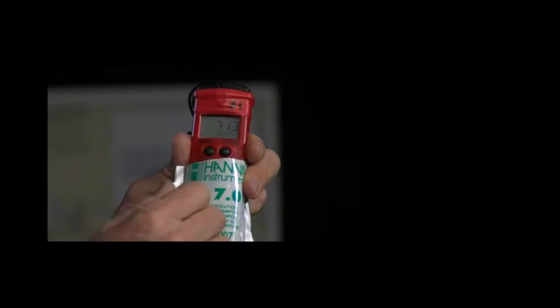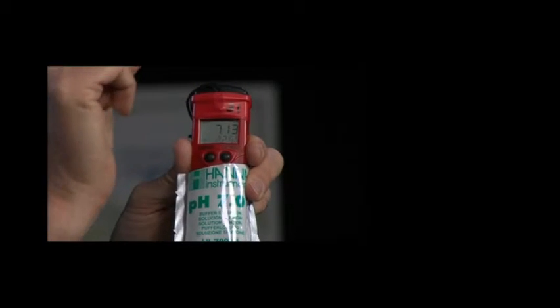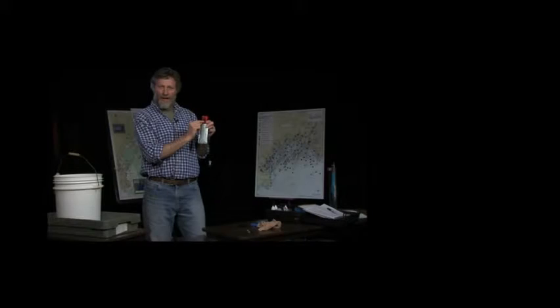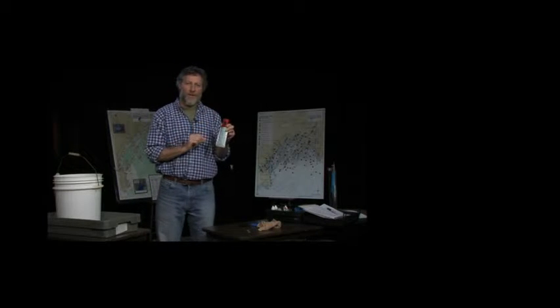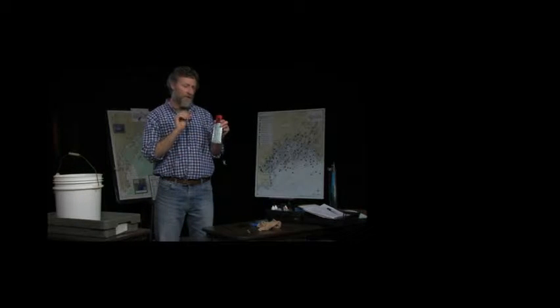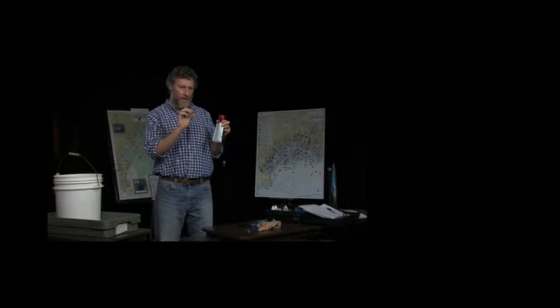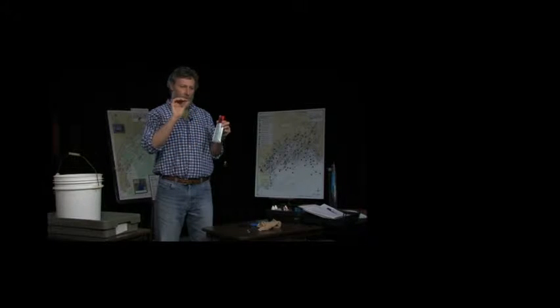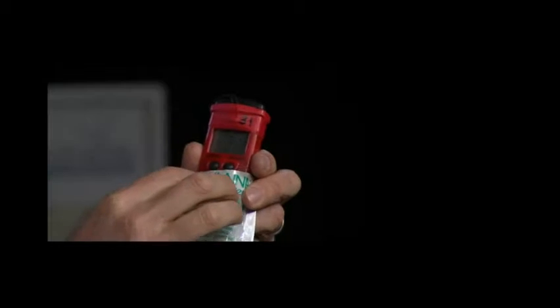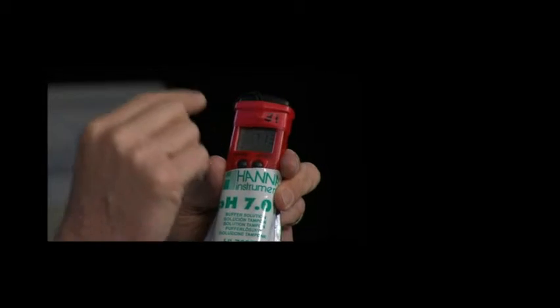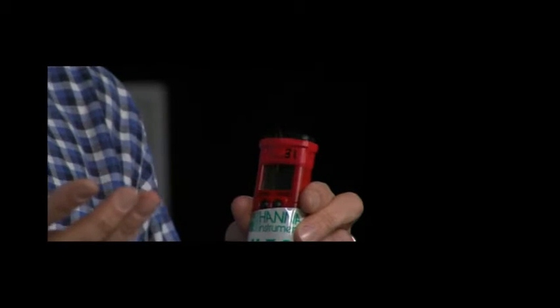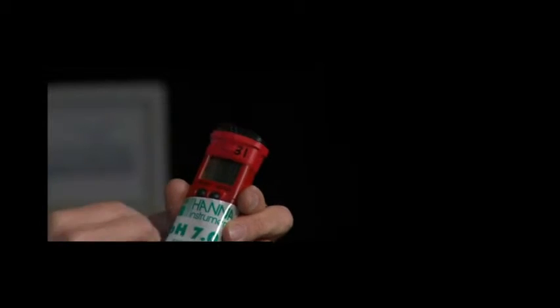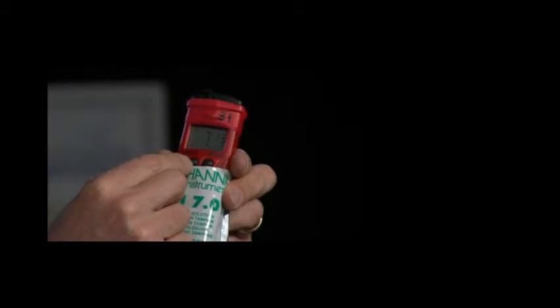It will start its calibration. It takes a few minutes to do it. The numbers sort of flash a little bit. Then it will go from 7.0 and then it will want you to switch to a different solution. I mentioned before that you can calibrate with a 7, a 10, and a 4. So it will then display a 4.